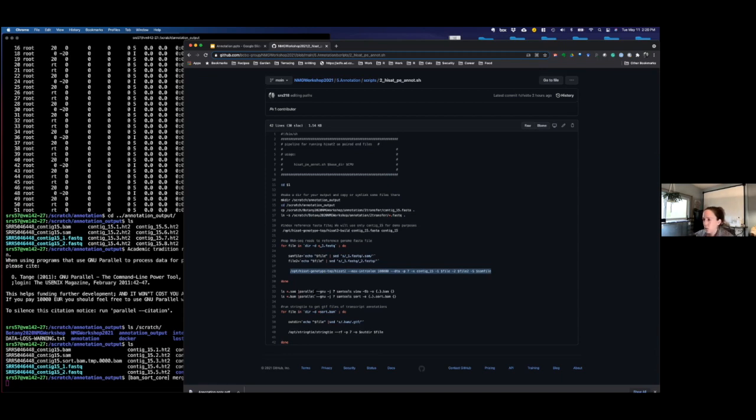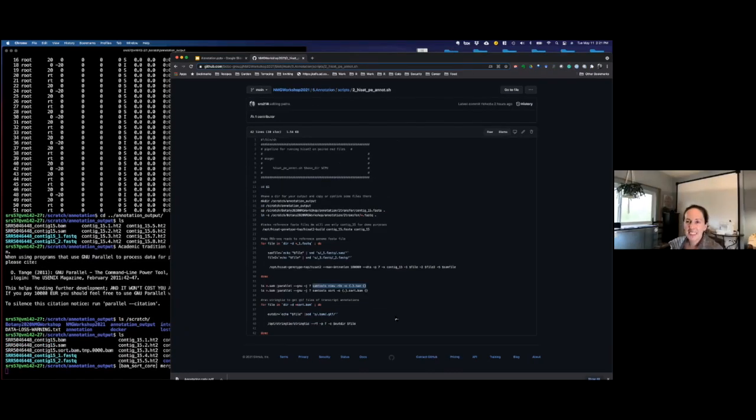And then it uses this tool called parallel. If you had 7 SAM files, let's say, then you would have 7 instances of SAM tools running. This would allow it to run faster as opposed to just running on one core, one instance. This isn't the sort; this is taking SAM to BAM. Does anyone know why we convert SAM to BAM? I'm sure there's some of you out there that are familiar with this stuff.